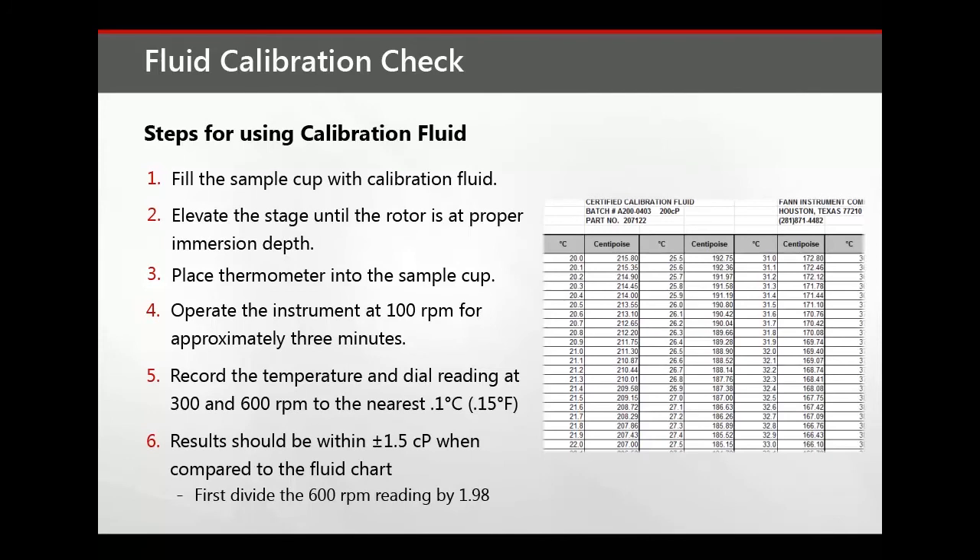After the calibration check, carefully wipe clean the rotor surfaces, including the inner and outer portions, as well as the bob, thermometer, sample cup, and work area.